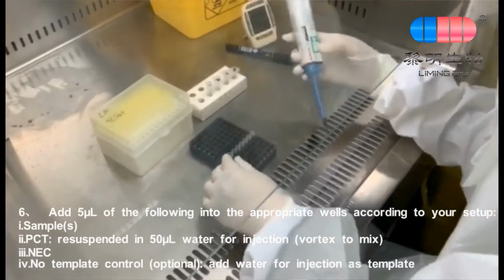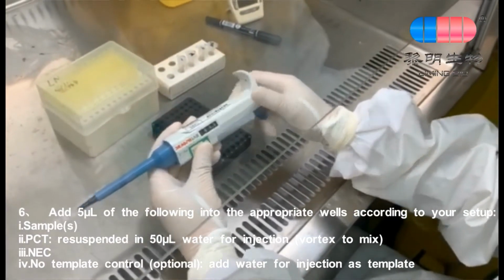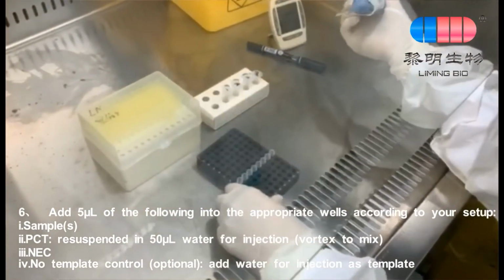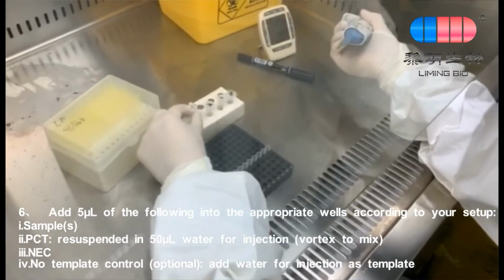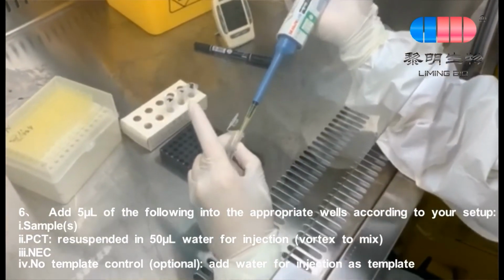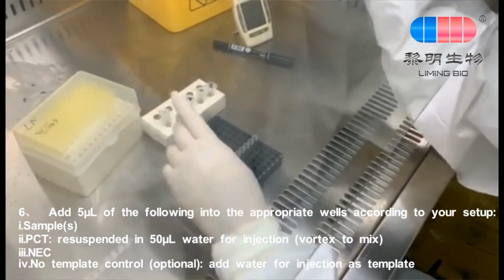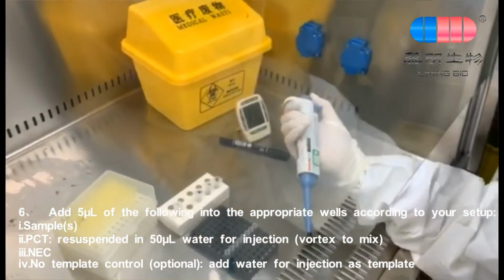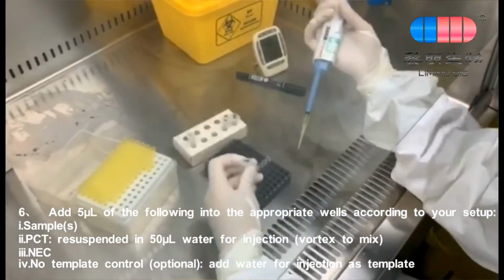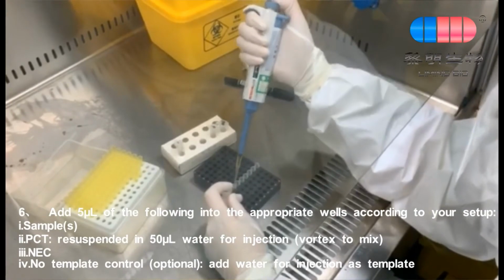Add 5 microliter of the following into the appropriate wells according to your setup. 1. Samples. 2. PCT, resuspended in 50 microliter water for injection. Vortex to mix. 3. NEC. 4. No template control, optional. Add water for injection as template.